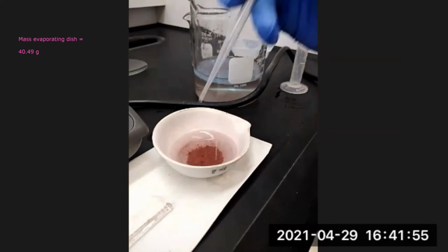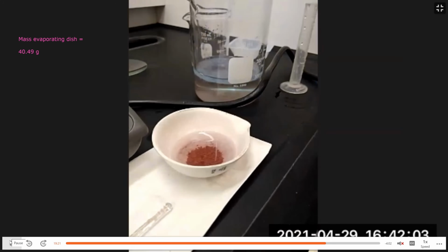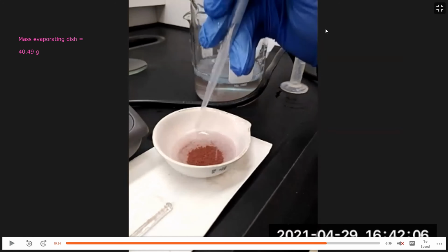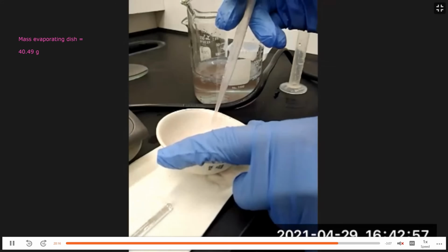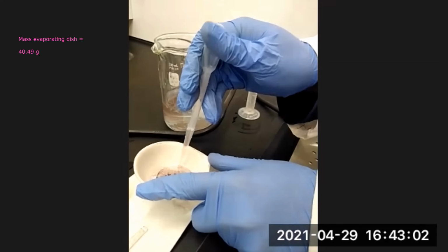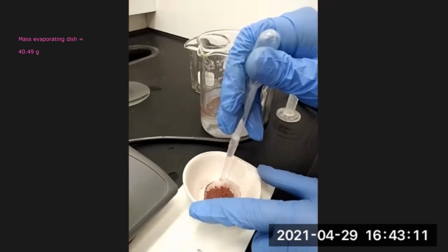Notice we have a waste beaker that all our waste, aqueous waste or solution waste goes in. So again, this process does take several minutes. I kind of time lapse through it. But again, you have to use the dropper very carefully, remove all the solution, because the more you remove, the better the drying will occur in the oven. So it is a very tedious process that you have to take your time and patience with.